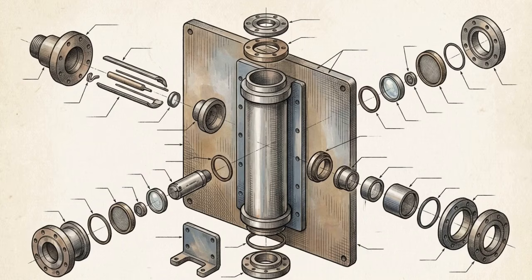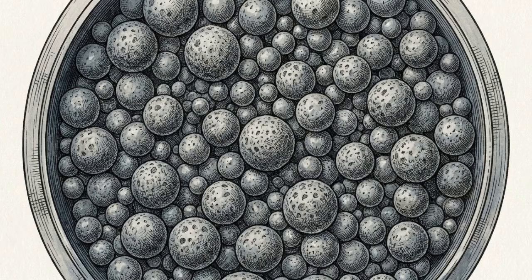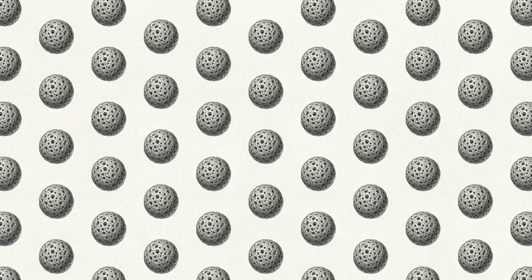With the sample now in the flow, it hits the analytical column. This thick-walled stainless steel tube is where the actual chemical separation takes place. The inside of this column is packed solid with the stationary phase, millions of microscopic silica particles, usually coated with specific organic molecules. When our tight band of mixed samples slams into this dense matrix, a chemical competition begins.